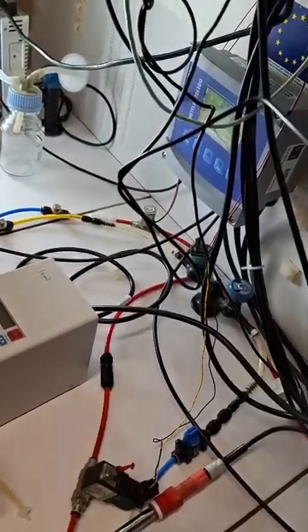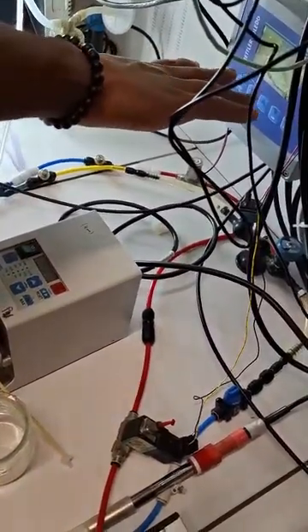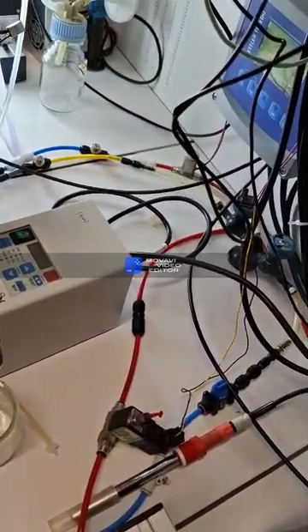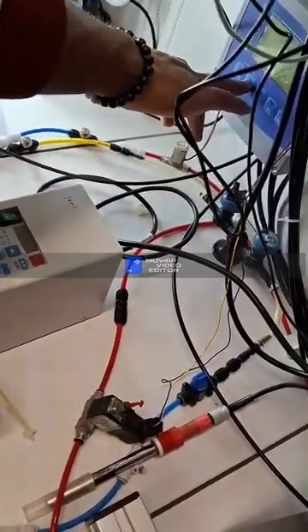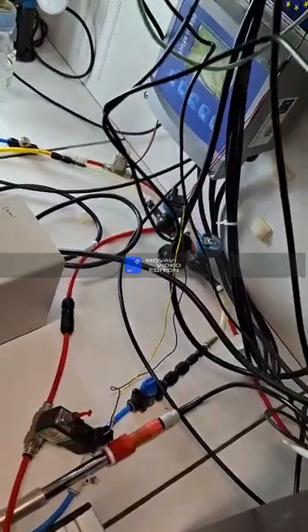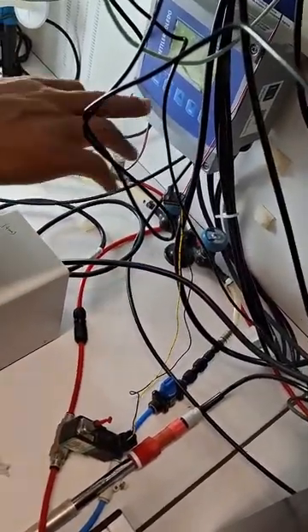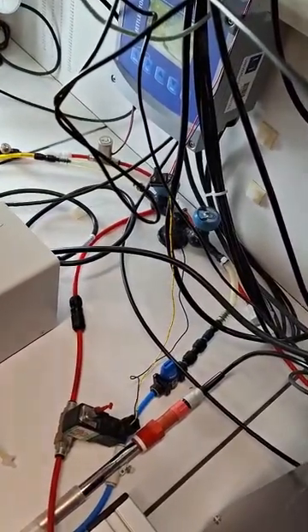4-1. Okay. And what did you do here, exactly? I just set up the pH calibration point. Just push calibrate, and after push pH, enter. After 1 point, enter, and that's it.